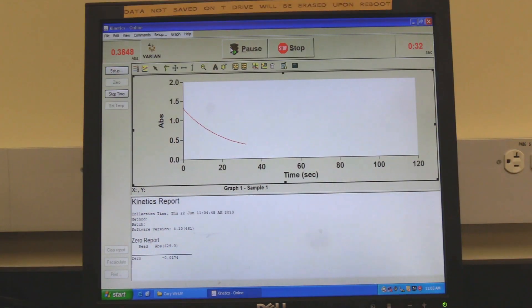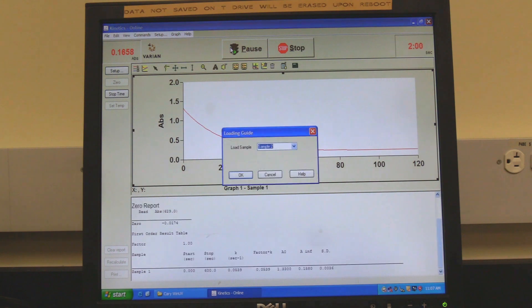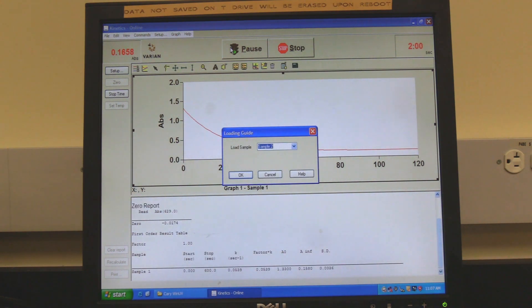Wait for the measurement to finish. The spectrum will appear. The software will prompt for the next sample name. If measuring another sample, click on OK.